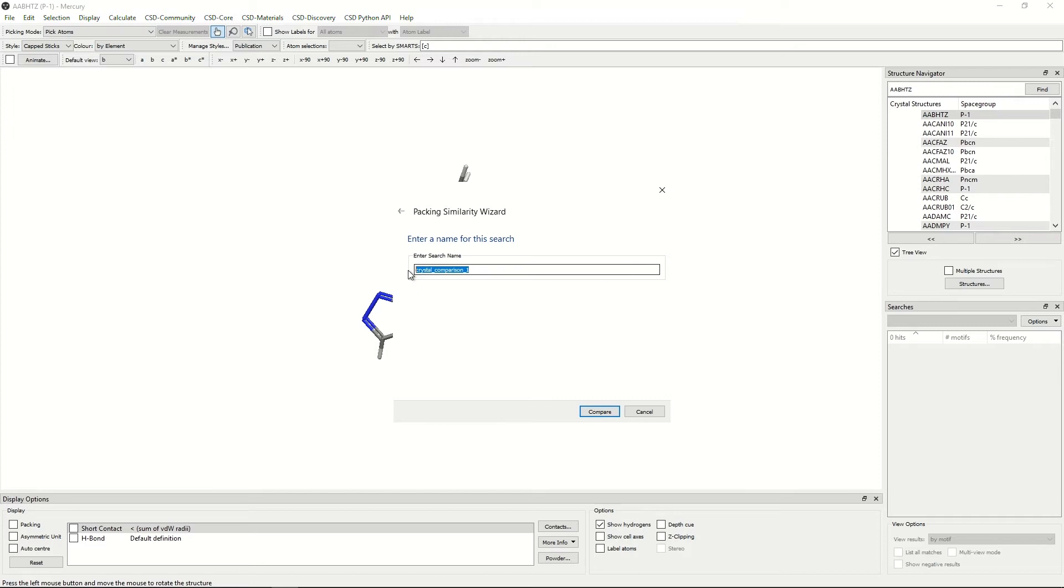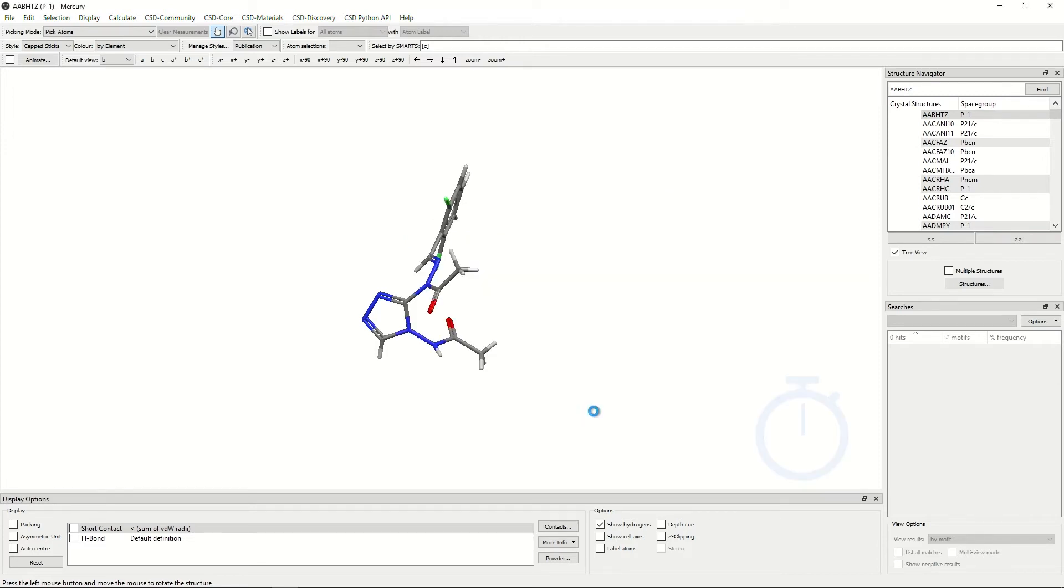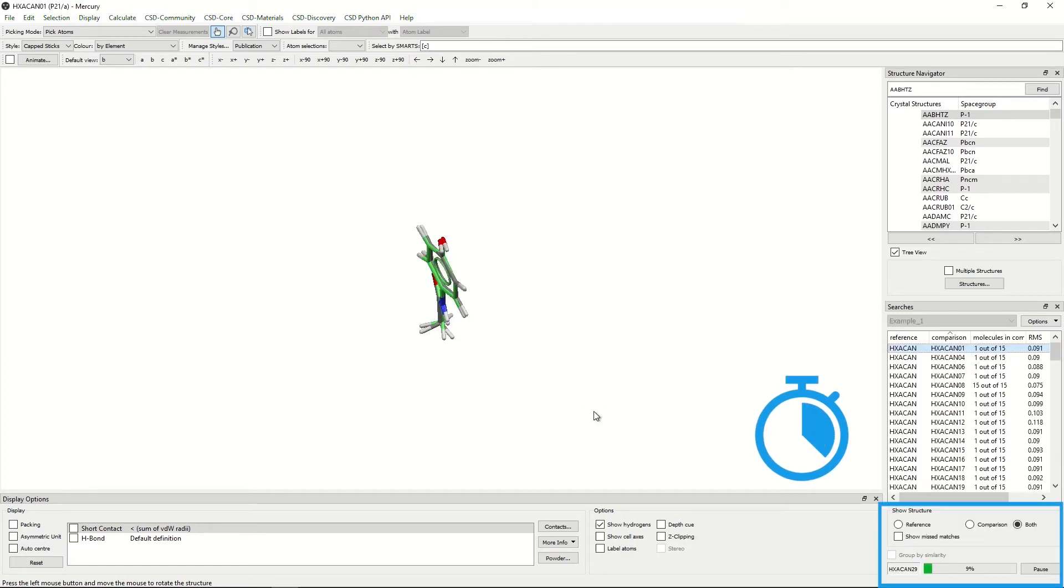Here you can name your search. Here I will call it example one and click prepare. This will take about a minute. There will be a progress bar which appears in the bottom right hand corner of the screen. Once that reaches 100%, that means the search is complete.